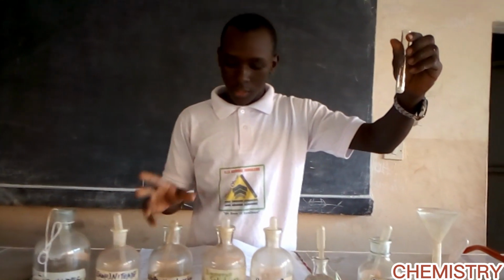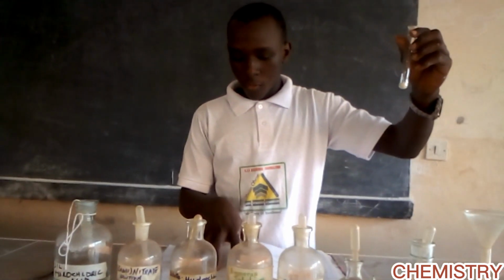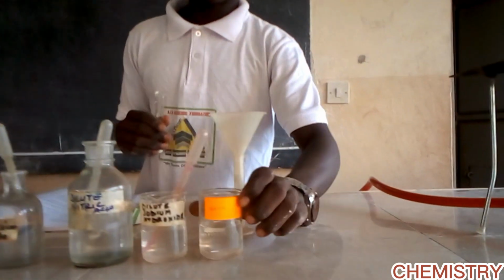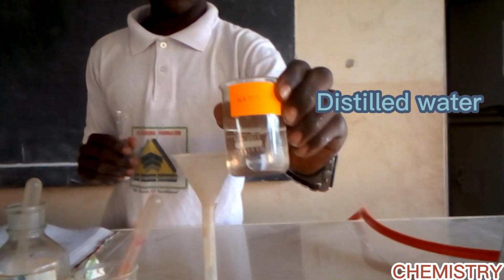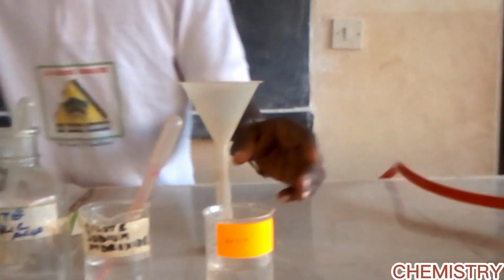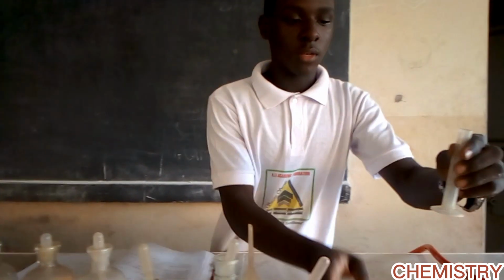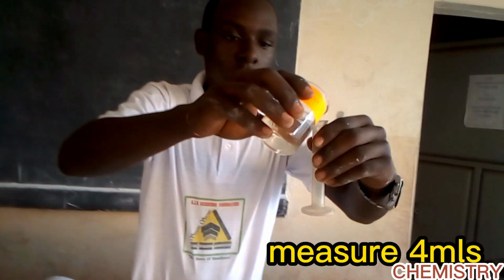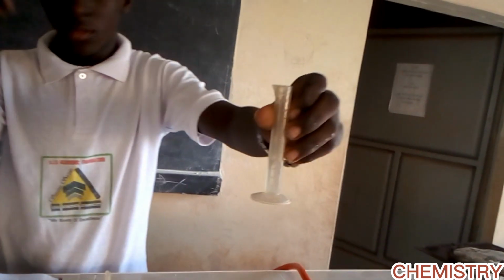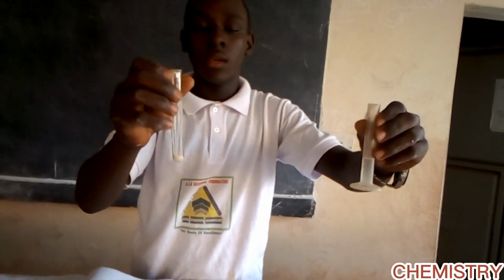Now they have said add 4 centimeters cubed of water and shake strongly to dissolve. As you can see, this is our clean water, and we are going to measure 4 centimeters cubed using this measuring cylinder. So this is our 4 centimeters cubed, and we are going to add it to the solid we put in the clean test tube.